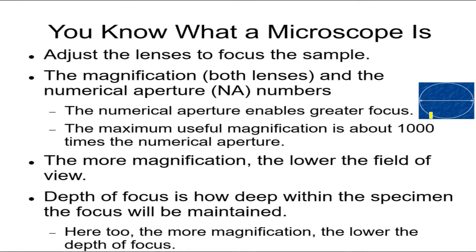Now, I said field of view is what you can see all around in the view of your microscope. However, this is only from side to side. There is also what they call a depth of focus. If your field of view is only, let's say, from here to here, and let's say that contains the tip of the needle, up and down also, your microscope will not be able to get much more of a distance than you have from side to side. If the tip of the needle is 1 micrometer, you'll only be able to get information 1 micrometer deep from that tip of the needle.